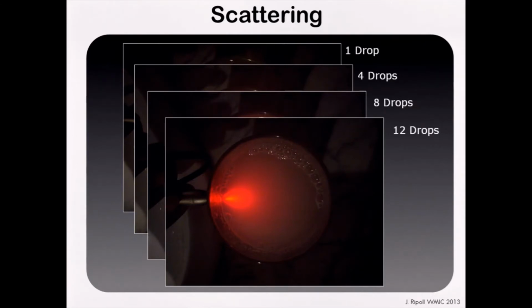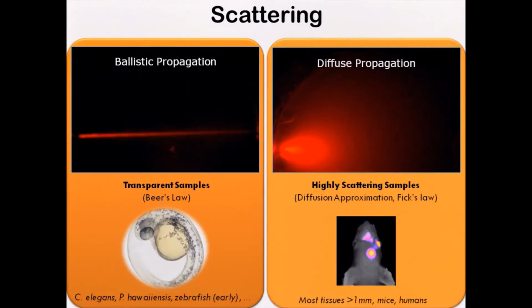I'm going to be presenting results that have to do with microscopy. And in this case, we'll be assuming that light propagates ballistically, so that we can use microscopy. Now, the next talk, that Joe Culver is going to present, they need to assume that light diffuses inside tissue, or there are other models in between those two that make our modeling of light propagation much better. And this also relates to what Vasilis, I believe, will be presenting at the end, with how you model how light reaches the tissue before you can obtain an acoustic signal.